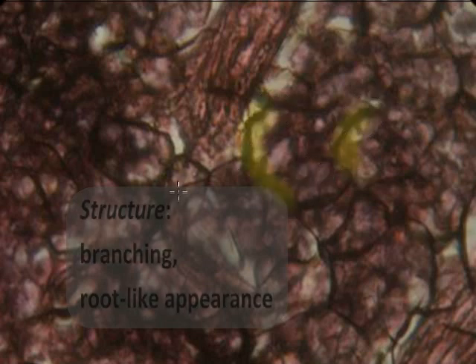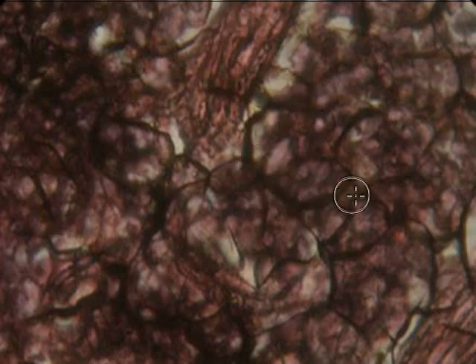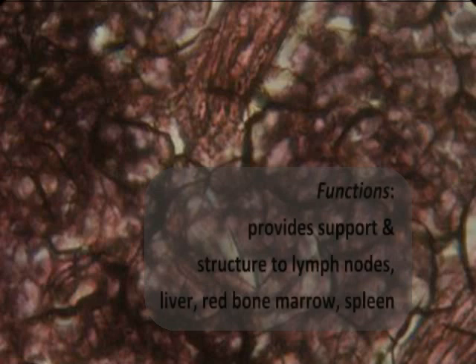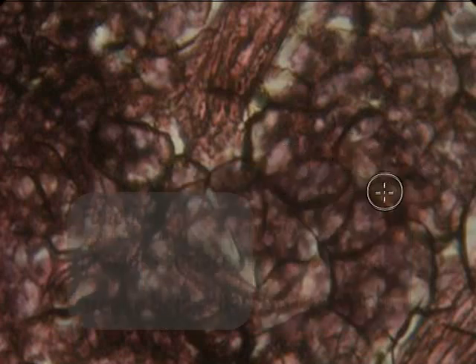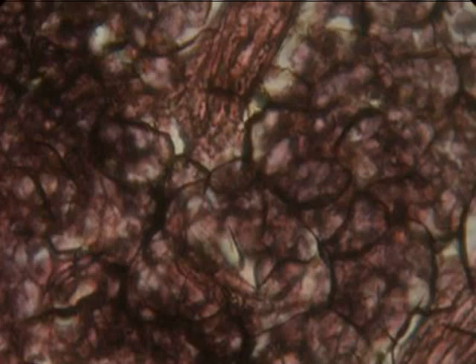Our final loose connective tissue is reticular connective tissue, and the search image here is roots — almost as if you're looking at soil and plant roots under the microscope. 'Reticular' means branching, and these dark black or brown fibers provide tremendous support and structure to organs like the lymph nodes. It's also found in the liver, red bone marrow, and spleen, providing a lot of surface area to hold blood cells and white blood cells in those organs, helping to purify and filter tissue fluid as it passes through.